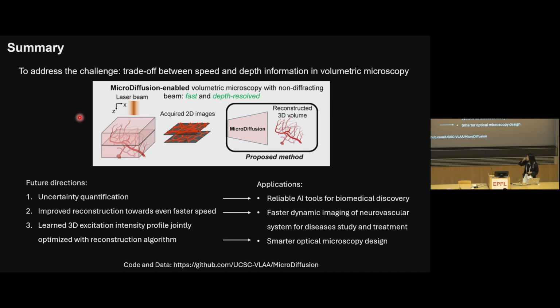And the second one is to improve the reconstruction to faster speed so that we can really visualize in real time this whole cortex response at the single cell level towards the external stimuli. And the third one is how can we design a smarter microscope by combining this programmable device with our algorithm.